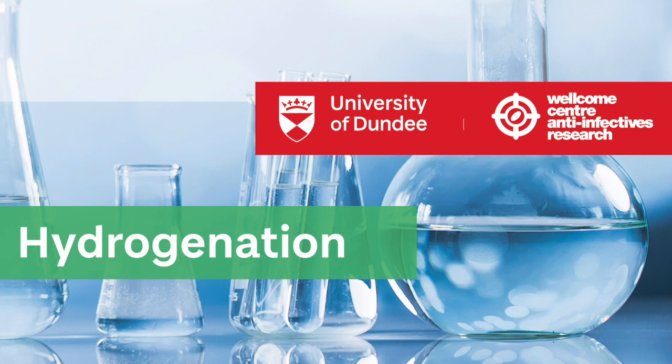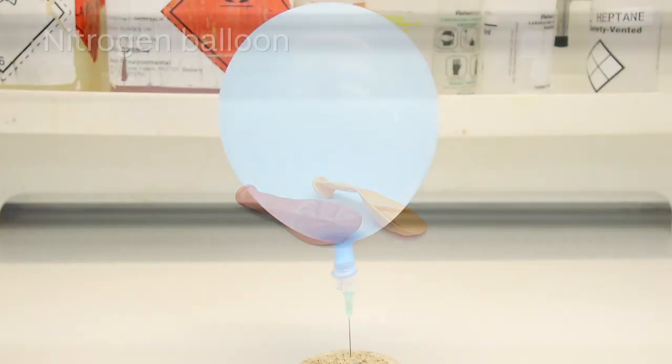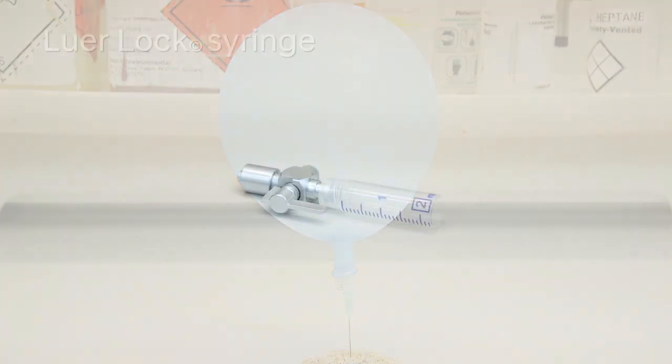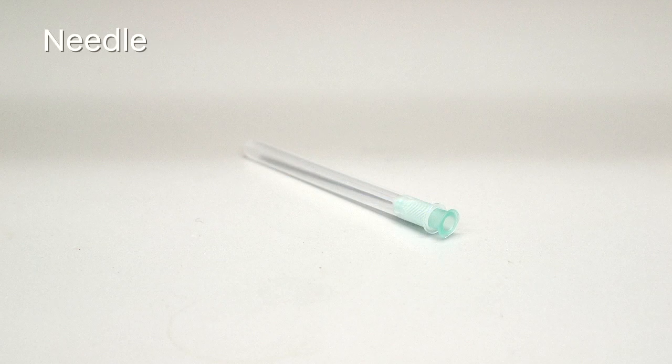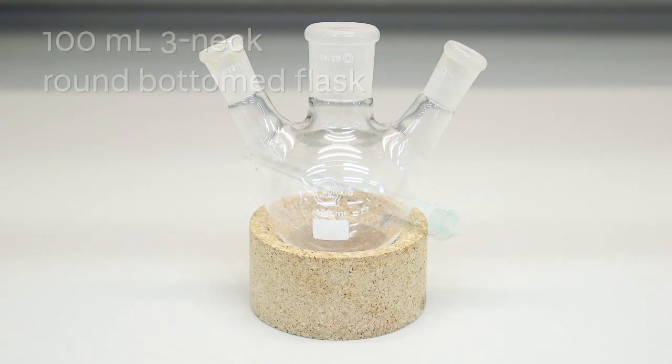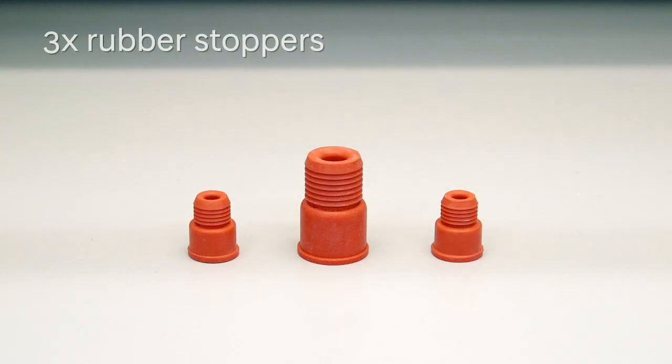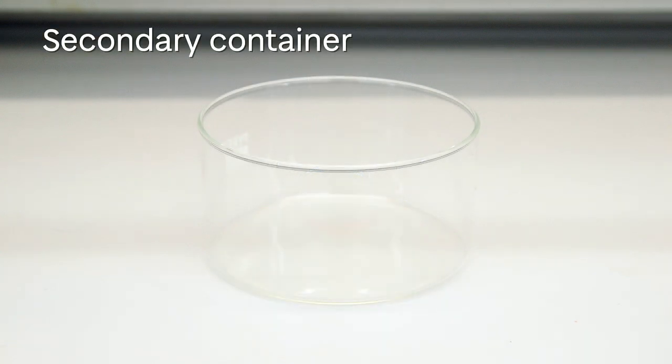For this reaction you will need two balloons for the hydrogen gas, one pre-filled balloon of nitrogen gas, a lure lock syringe, a needle, a 100 ml three neck round bottom flask, three rubber stoppers, a 100 ml single neck round bottom flask, and a secondary container.